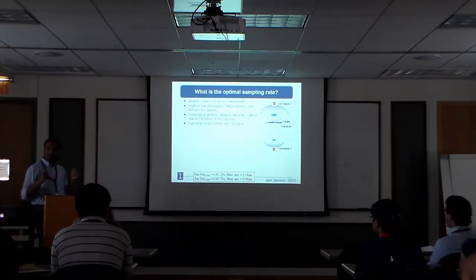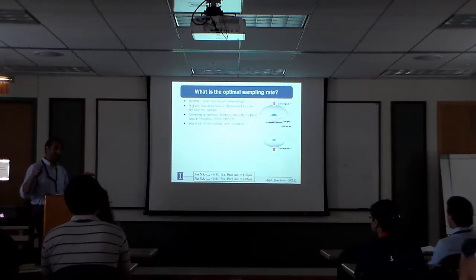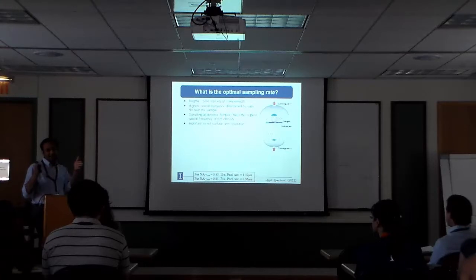right? Now if you had a photographic film with infinitely fine detectors and you put it there, you would see all of them, right? But our detector is actually discrete. It's a CCD type detector, right? It's a bin detector in that sense. So you're taking a certain spatial region and you're binning it down, right?